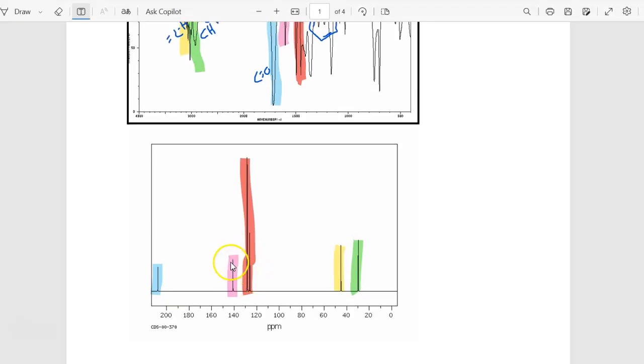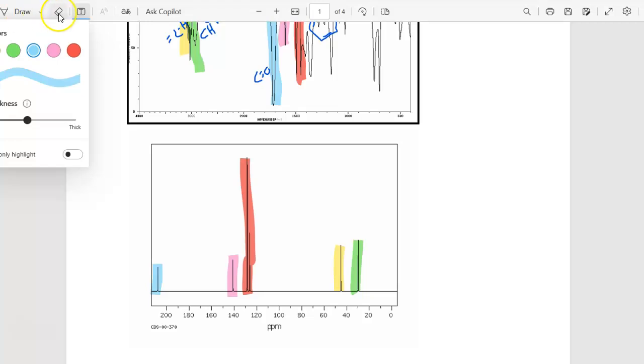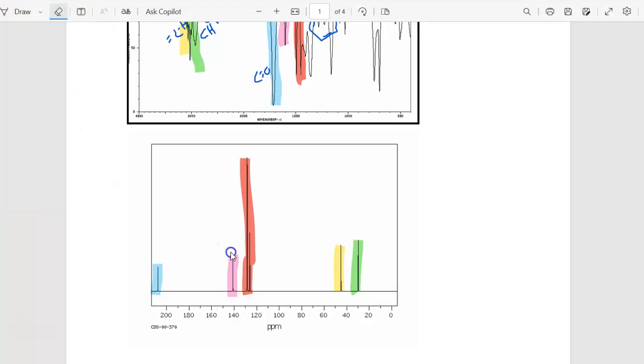So we're talking about this one, which I have changed my mind about. We know, like I was saying, that this 13C NMR spectra shows the unique carbons. And I want to erase that, but it's not coming, so we'll just hit it up.